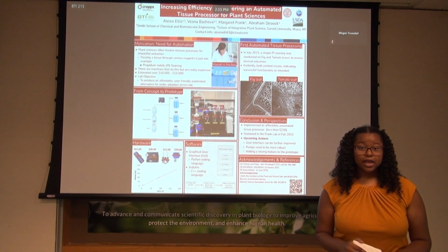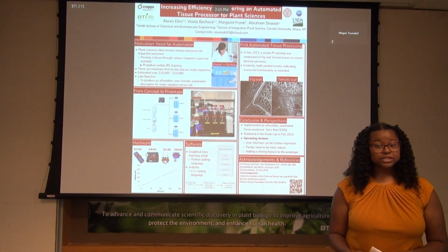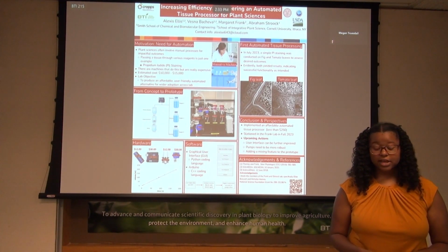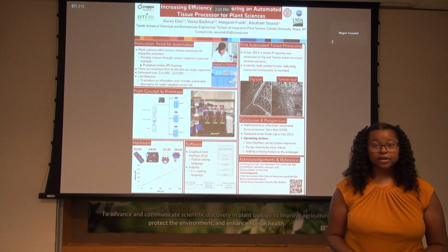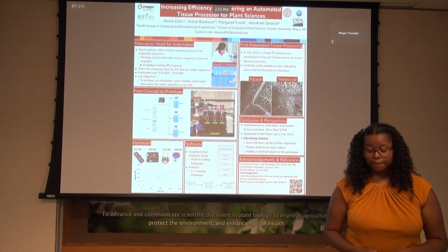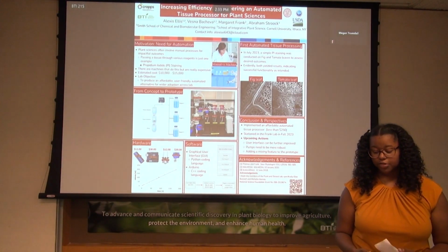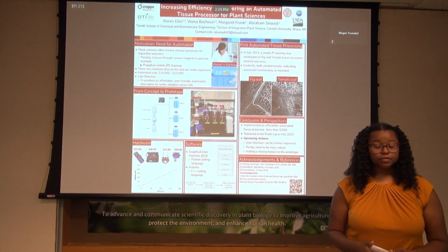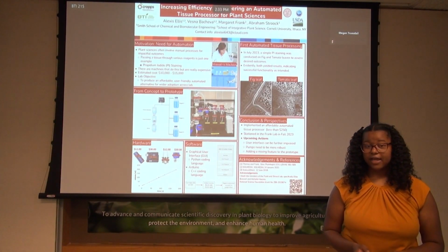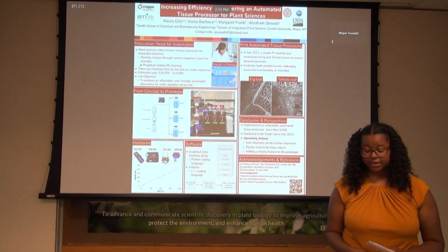In conclusion, I spent this summer building an affordable and easy to use graphical user interface as well as prototypes, so that we can minimize the amount of time and the amount of work that scientists go through for a typical PI stain. This whole automated tissue processor is also affordable, costing no more than $250. This will also be implemented in the Frank Lab later this fall, 2023, for further testing and redesign.